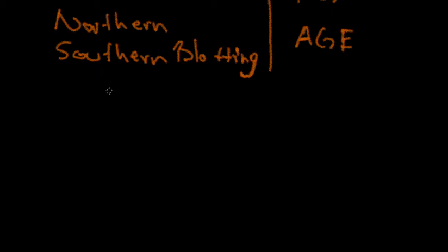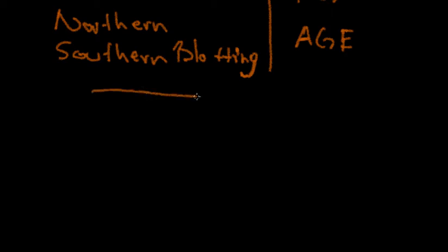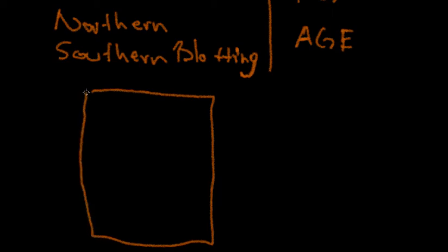What is the difference between her keratin and mine? So we can roll out a gel, or pour out a gel of polyacrylamide, and polyacrylamide is just a chemical that you buy in a lab. Or let me make a better gel. That's really ugly. And you just pour out a sheet of the stuff. Okay, and then in the wells, you're going to put in your various samples of keratin that you've extracted. Maybe you want to compare keratin molecules across species. Maybe you want to compare keratin samples across people.